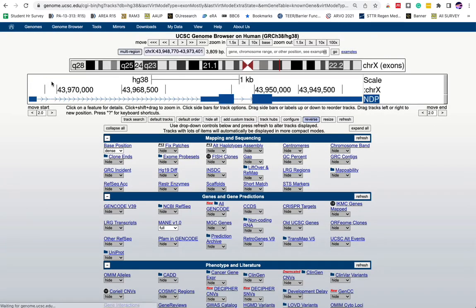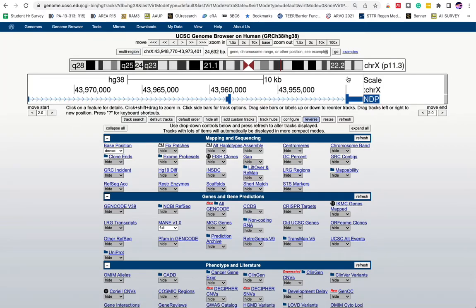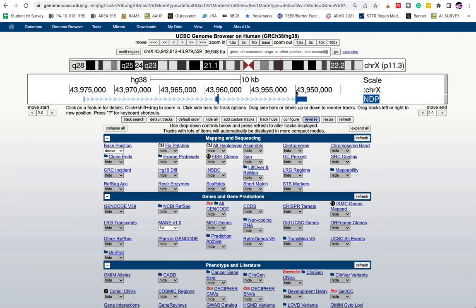EV. Oh, yeah, that worked that time. As you can see, it kind of shrunk one of the intron regions just for viewing, but I guess it's probably pretty good also in the default view. But here again, we've got our exons arranged from left to right, and that would be fine.